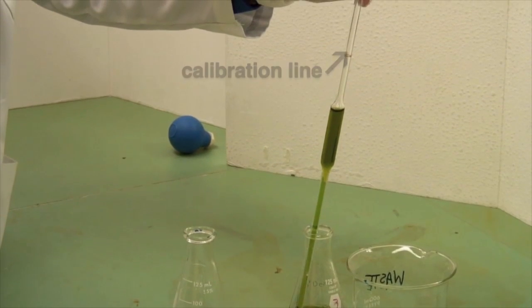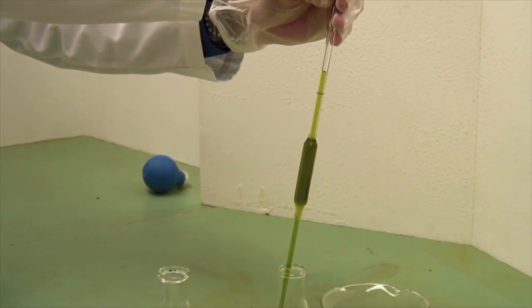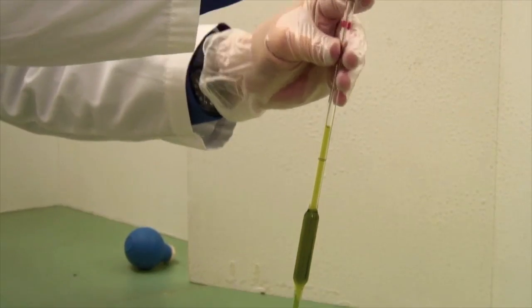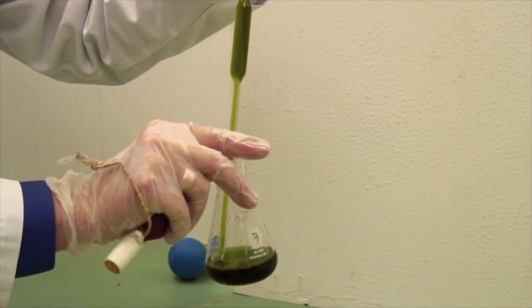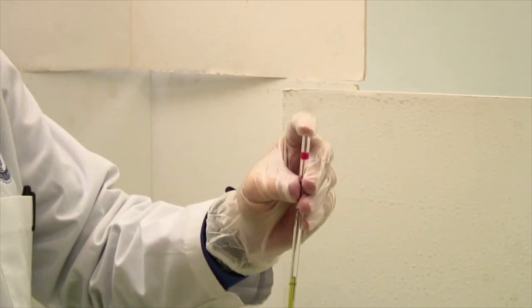It will move a lot faster when it's in the neck rather than in the bulb. Once it's well above that line, remove the bulb and capture it with your index finger. Use your index finger, not your thumb.